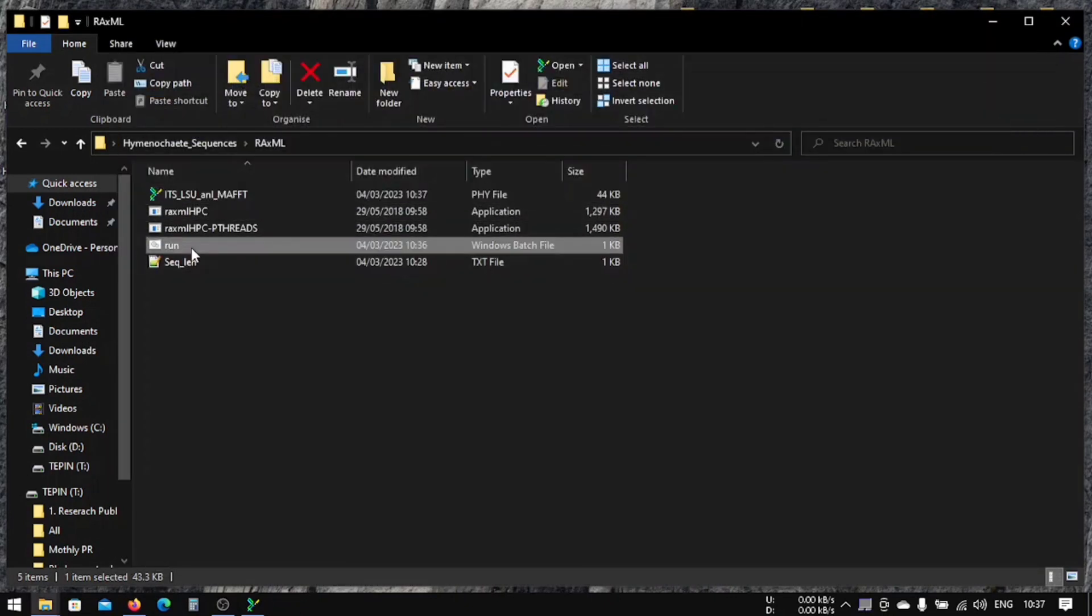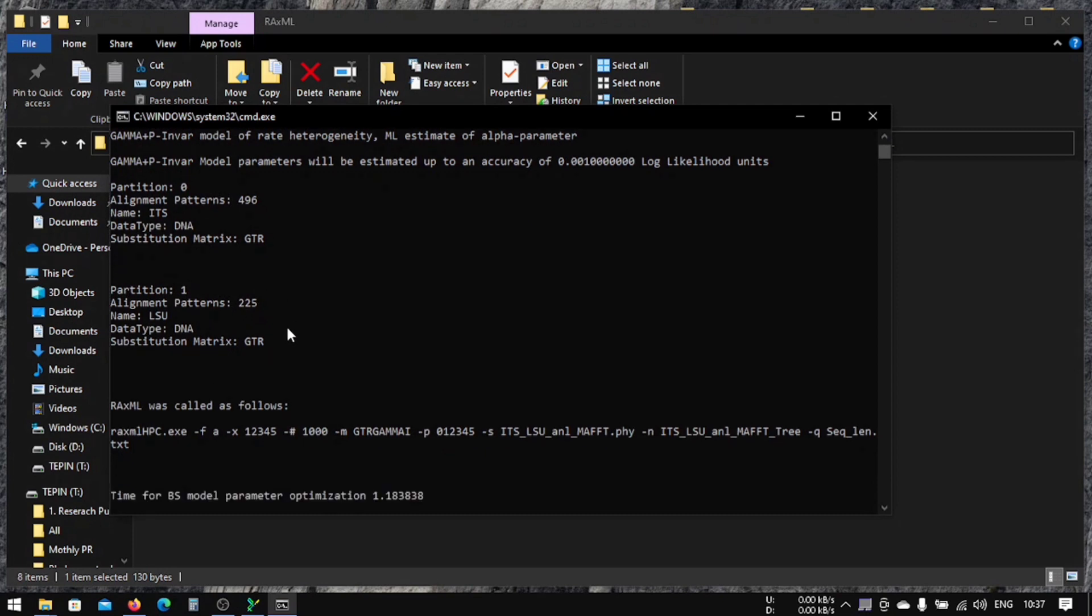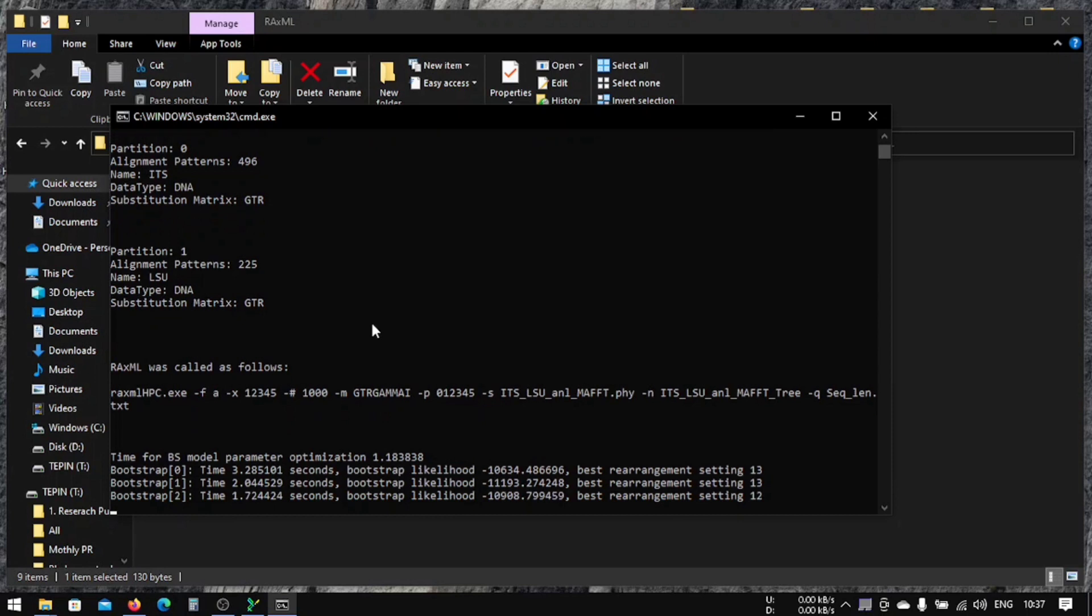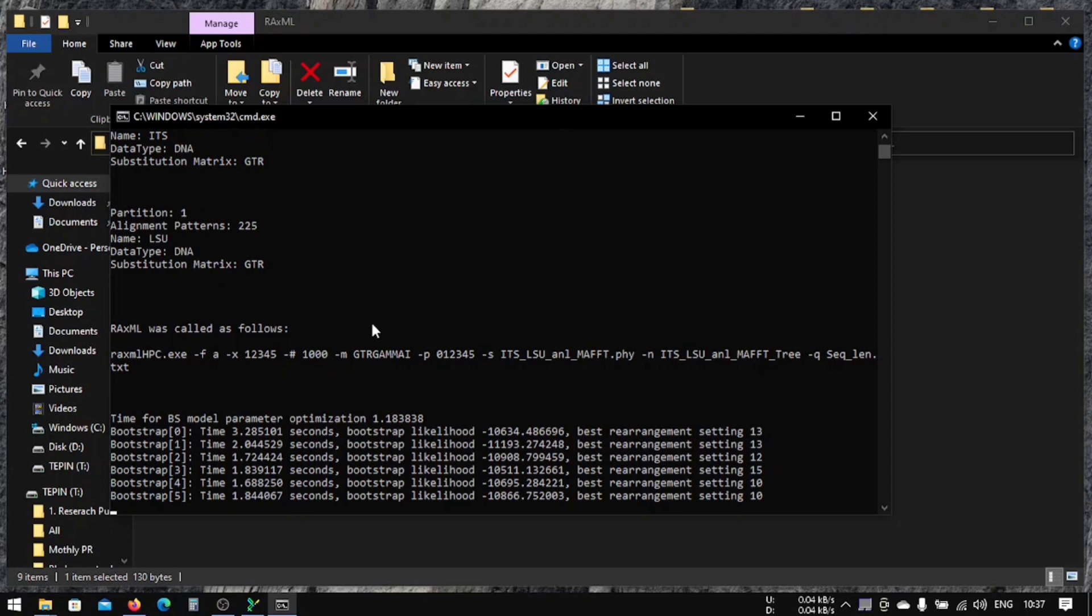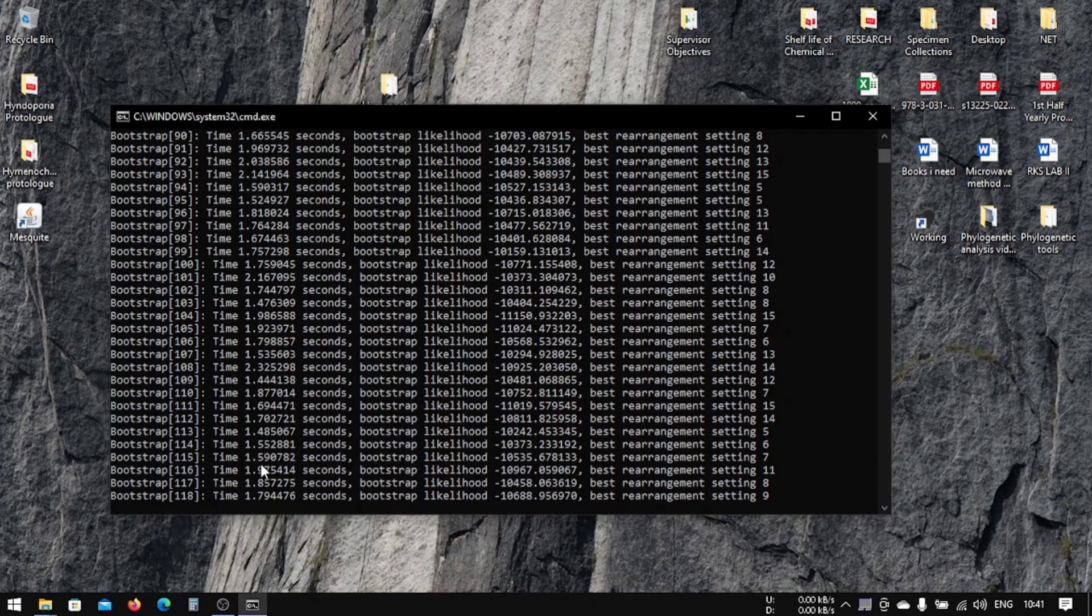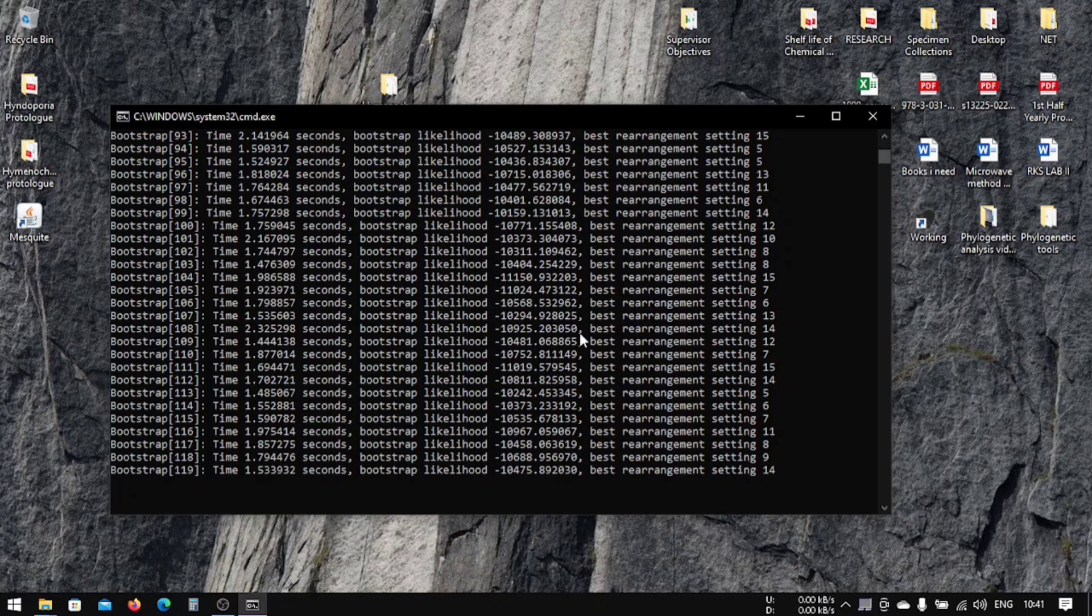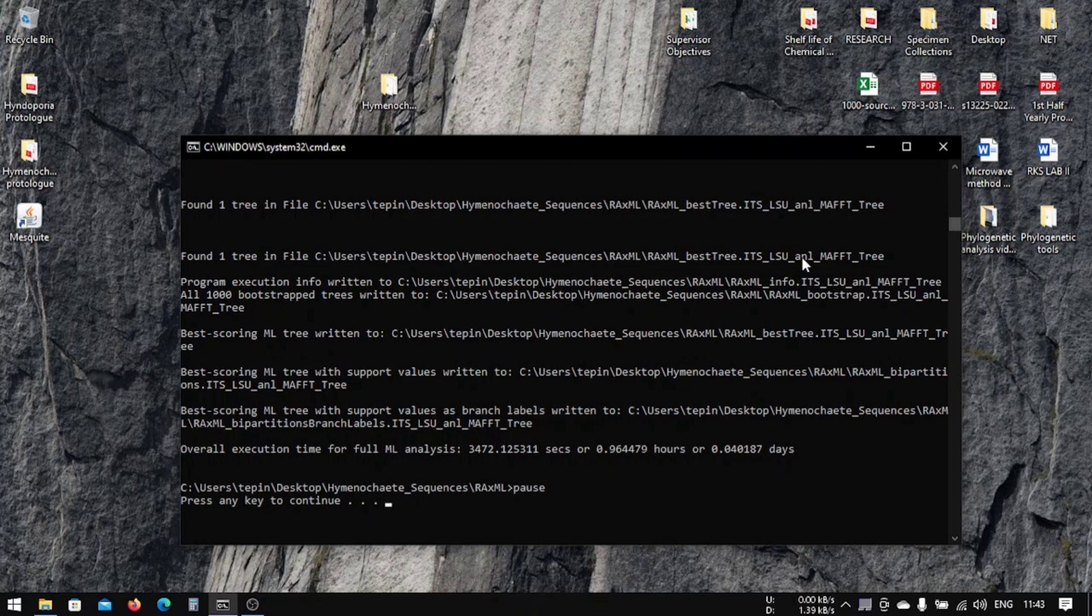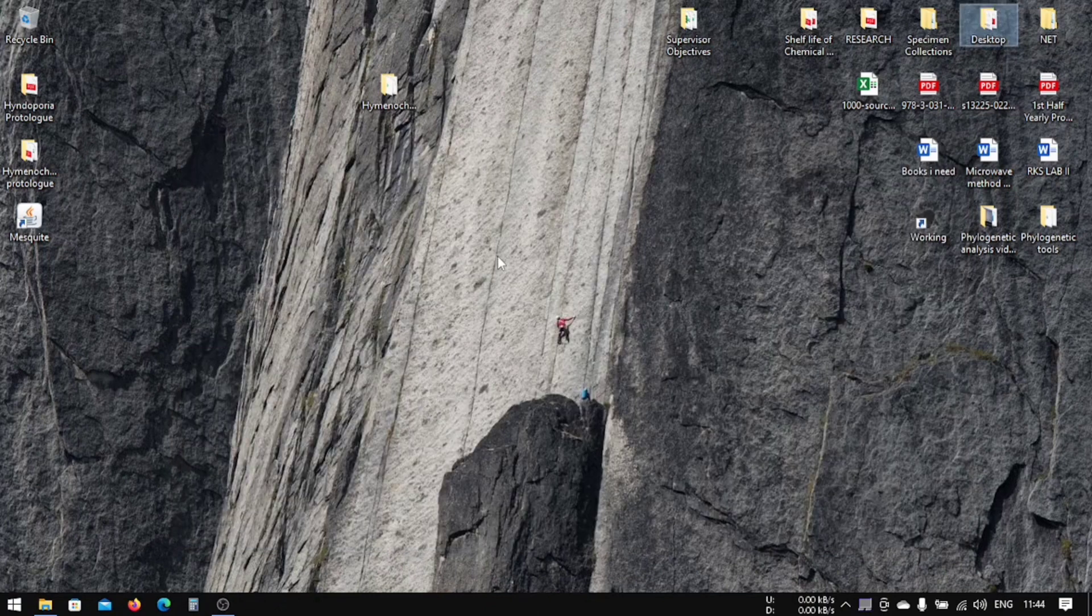Now we run it. It will start doing its bootstrap value, so it is going to take some time, so you have to wait for it. Sometimes you might get clicked here and it will stop running the process, but don't worry, don't close it. Just press Enter and it will continue doing what it was doing previously. So when you're done with ML maximum likelihood analysis in RAxML, this is what it looks like.